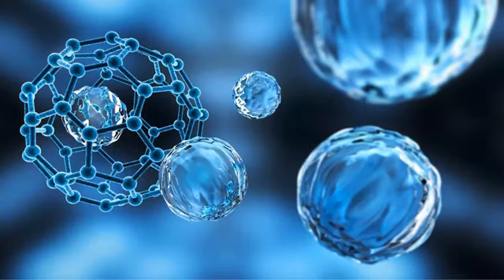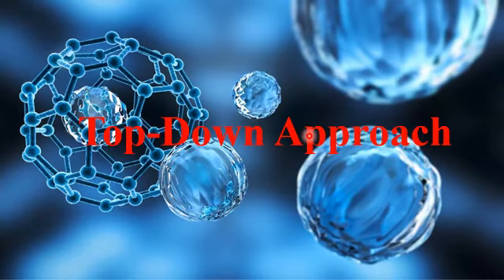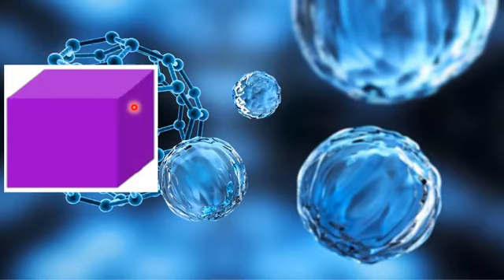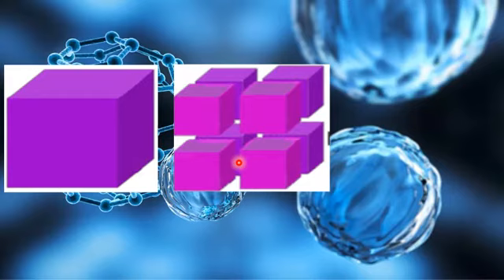So student, what do you think the term top to down approach means in nanotechnology? It can be simply explained by a schematic diagram: in a top to down approach we use a bulk material, which is visible with the naked eye, and this bulk material is converted into small particulates which are also visible, and these are the fragments and parts of the bulk material.